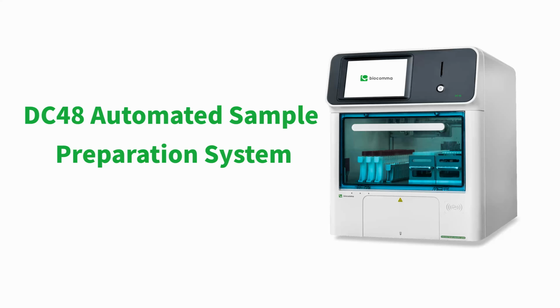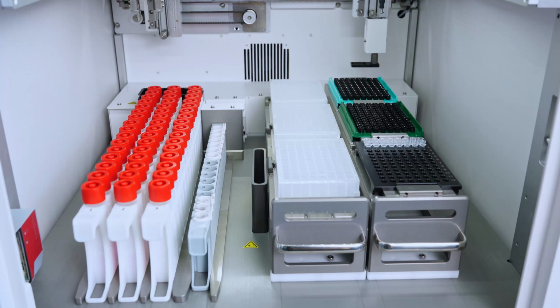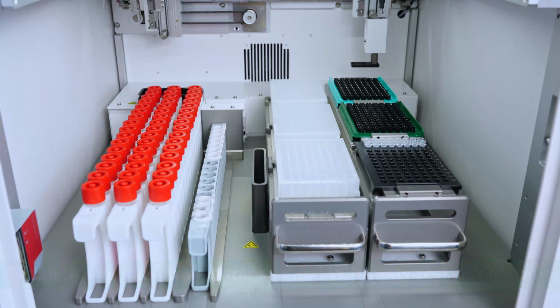DC48 Automated Sample Preparation System. Automatic decap, recap, and transport samples. Process 48 samples at the same time. Adopt with the 32-48-96 nucleic acid extraction system to realize high-throughput product transfer and PCR system establishment.